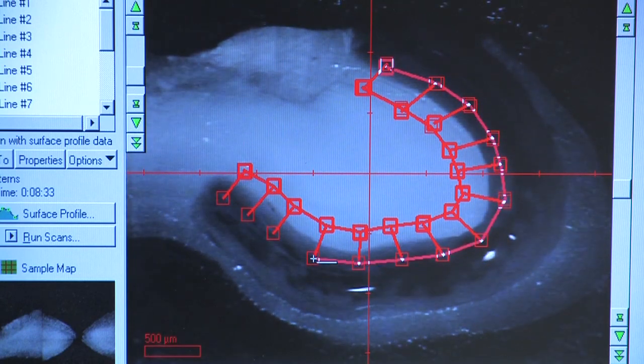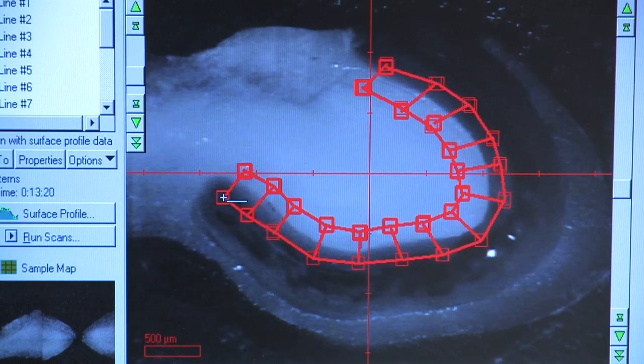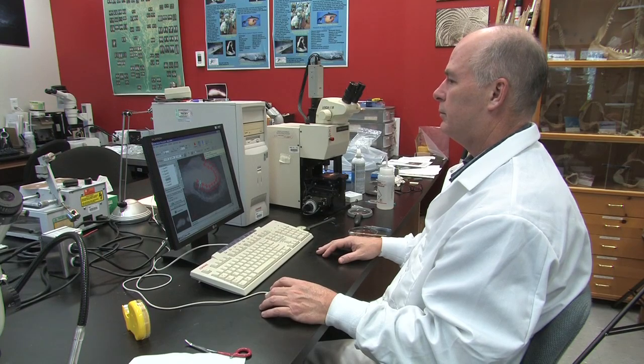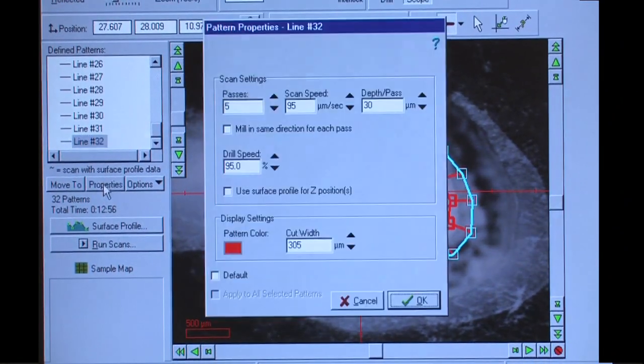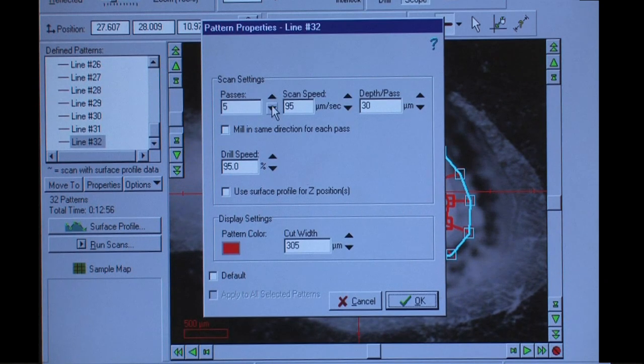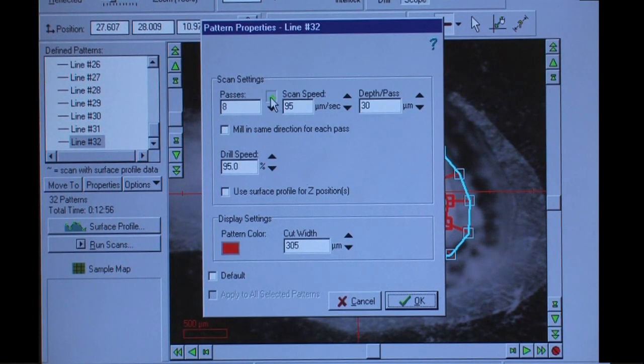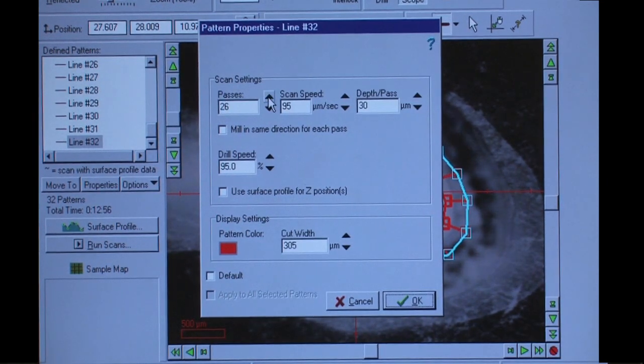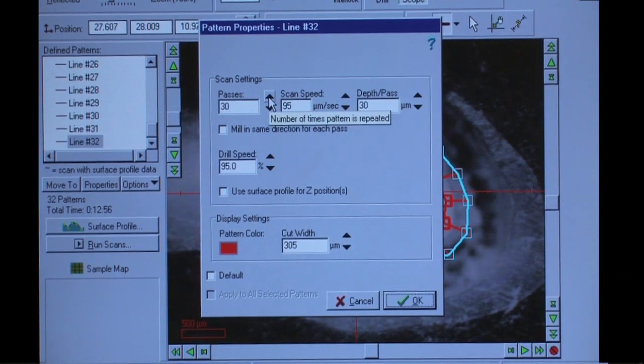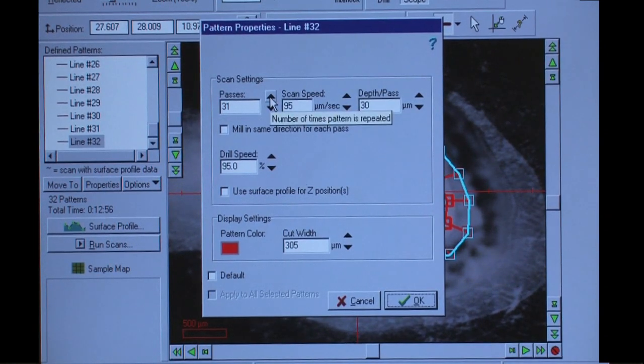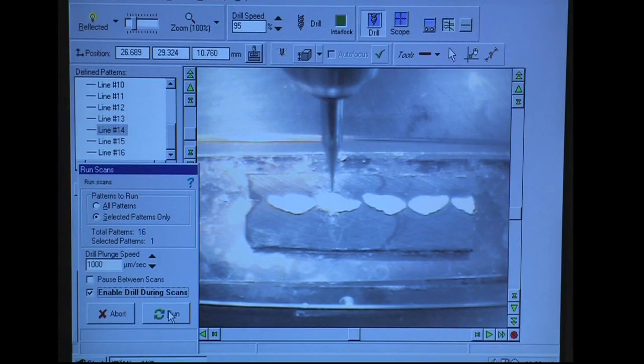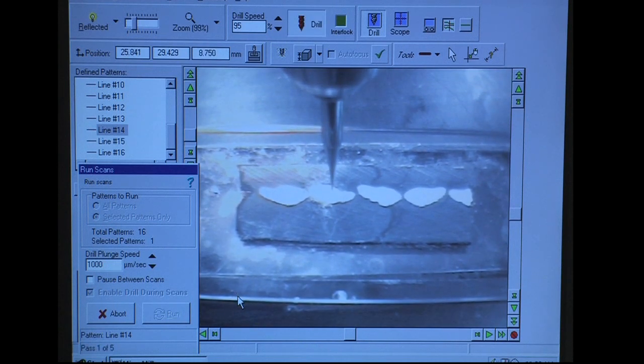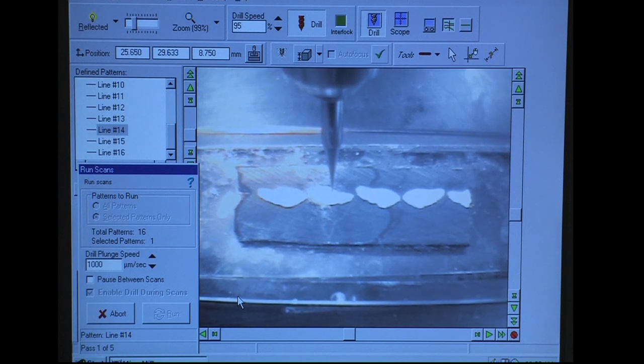This way, the edge of the drill bit is used to remove your sample material as the drill passes along each annulus. When you set the number of passes for the depth of the sample material you wish to collect, make it one or two passes less than the total you use to drill the coarse material. This is so that you don't collect any unwanted material in the area you cleared away. One pass or about 30 microns depth should be sufficient. Make several passes with the drill if needed to completely remove the annuli you wish to sample.